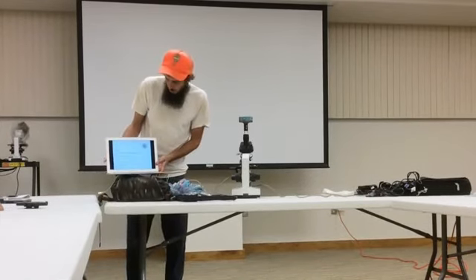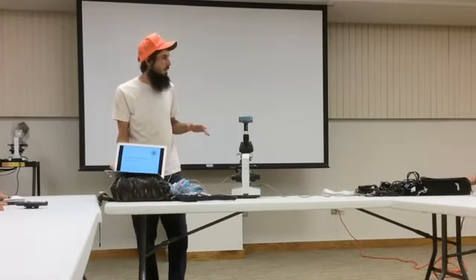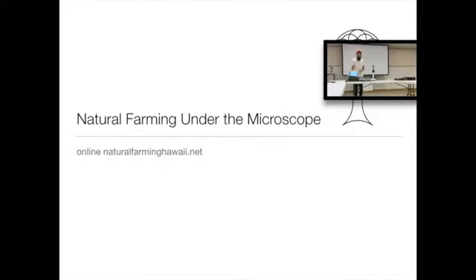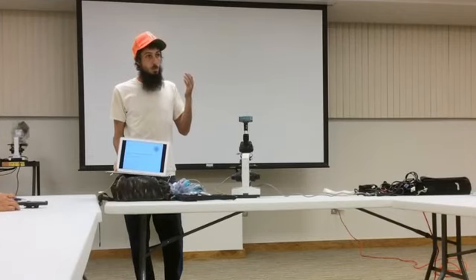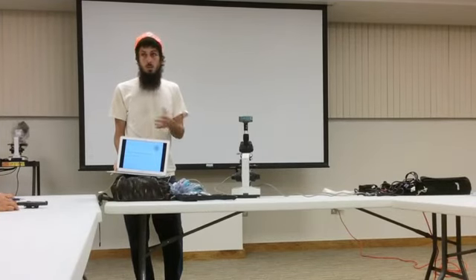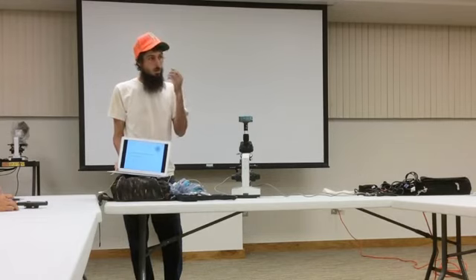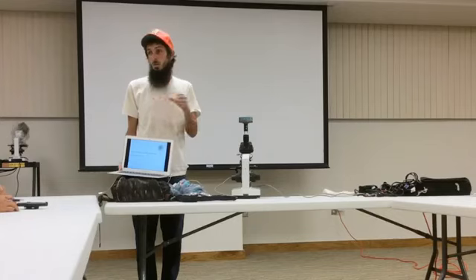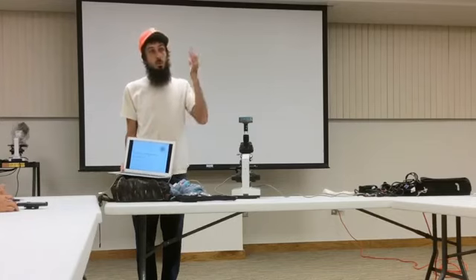So today, what I wanted to talk about here was the biology of natural farming and kind of explain a little bit of how I'm using the microscope to verify and validate different things that we observe. Like you see the plant grow really well. I'm trying to use the microscope to make that correlation where you can visually see it and test and see what biology is making plants grow better.